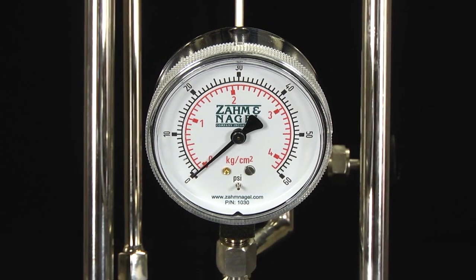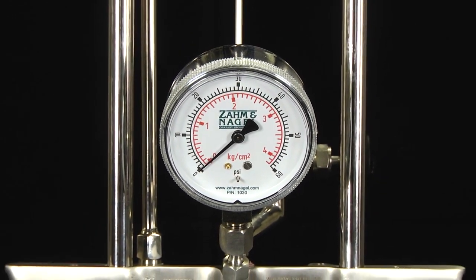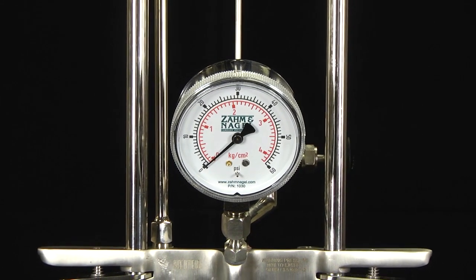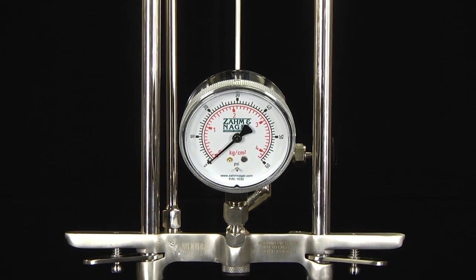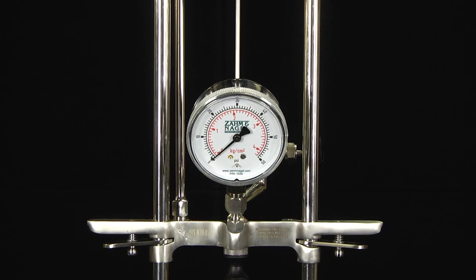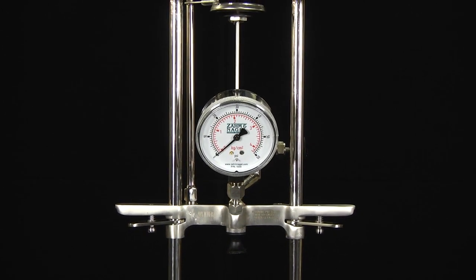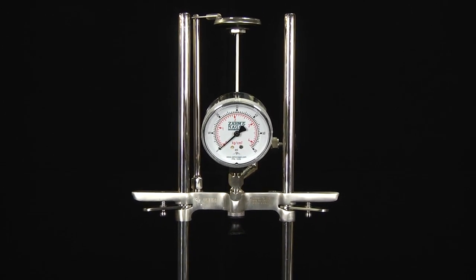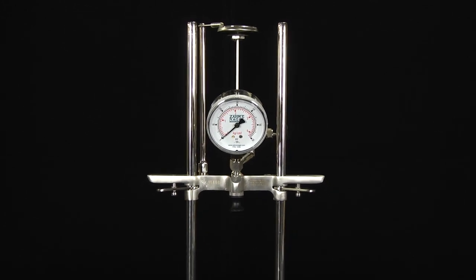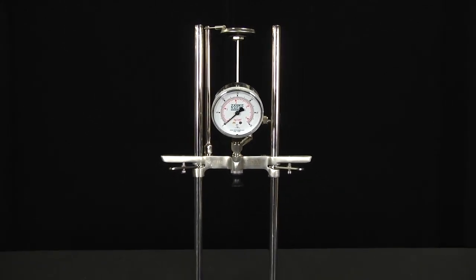The ZOM Series 6000 piercing device is used to test carbonated beverages for volumes of CO2 gas in glass bottles or cans. Available in 1 and 3 liter sizes, the Series 6000 will provide rapid and accurate determination of gas volumes in alcoholic and non-alcoholic beverages.